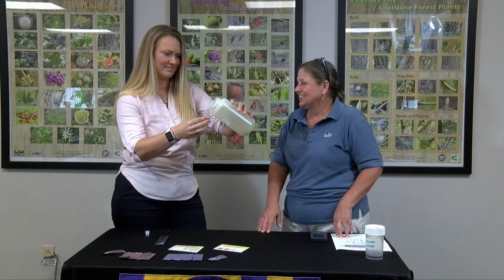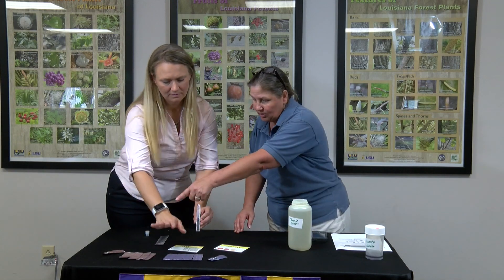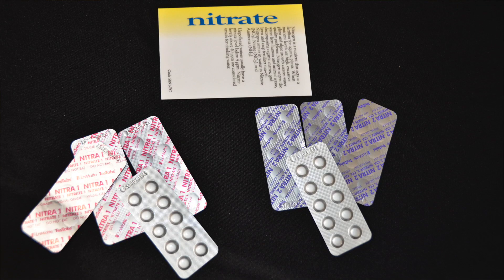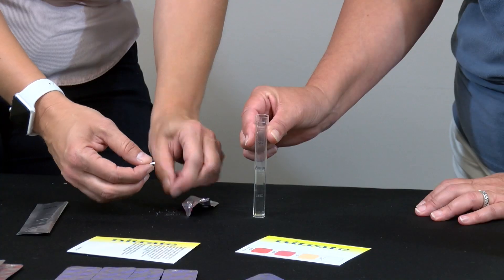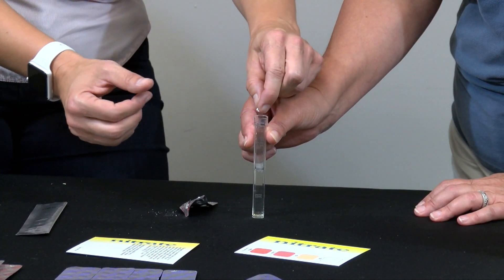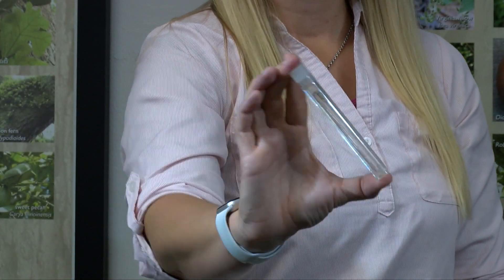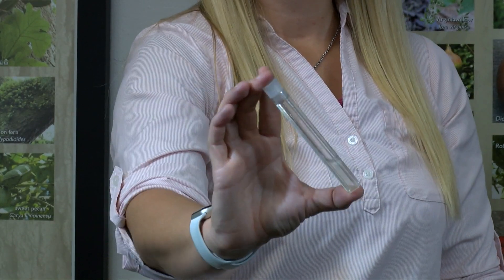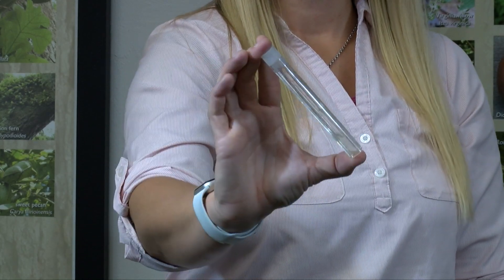Then we'll take the Nitrate One tablet, break it in half, and mix until it's fully disintegrated.